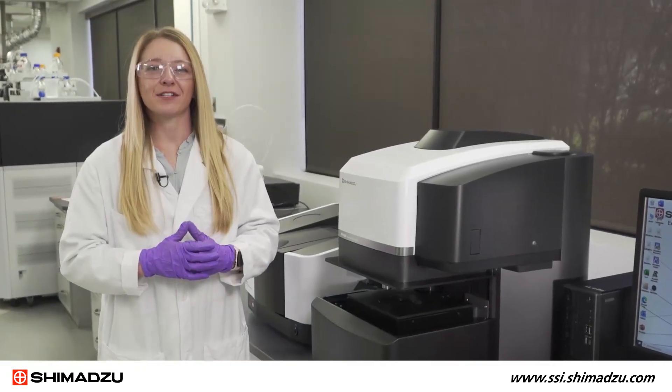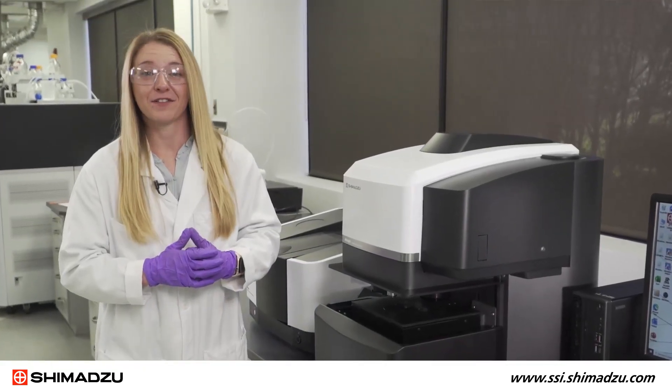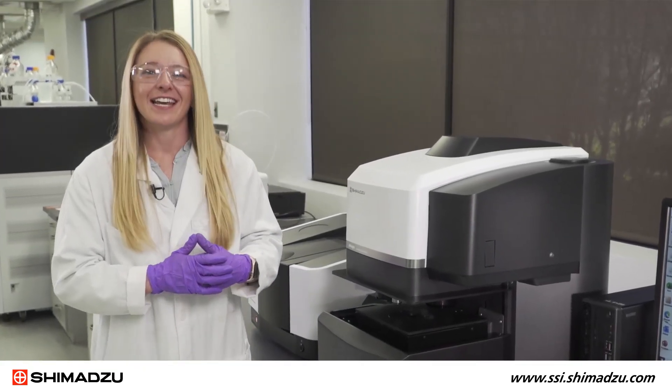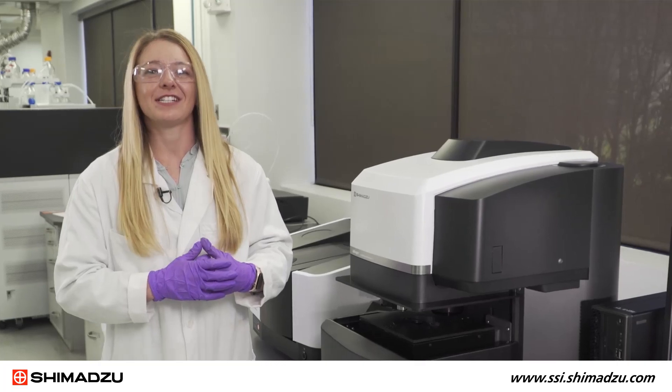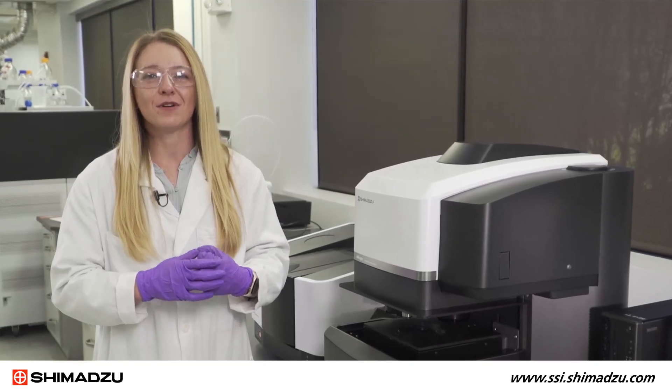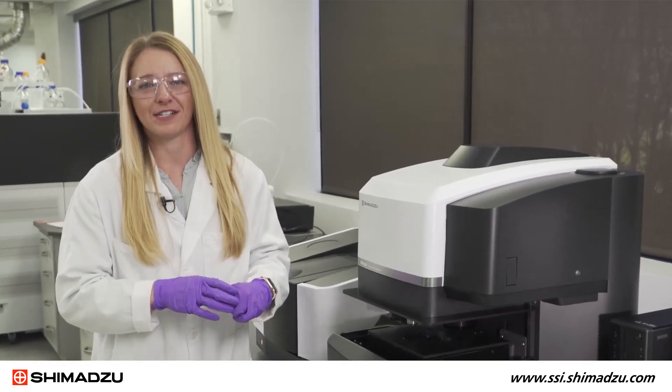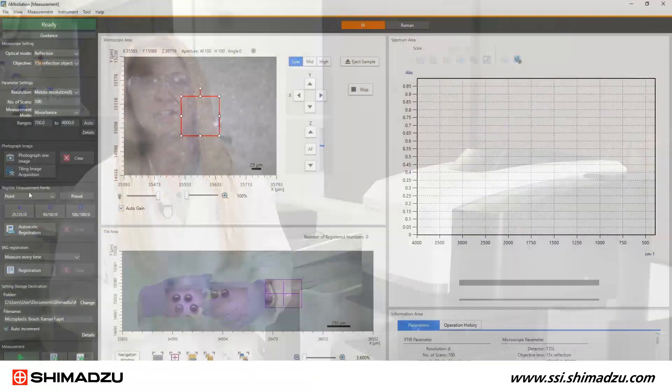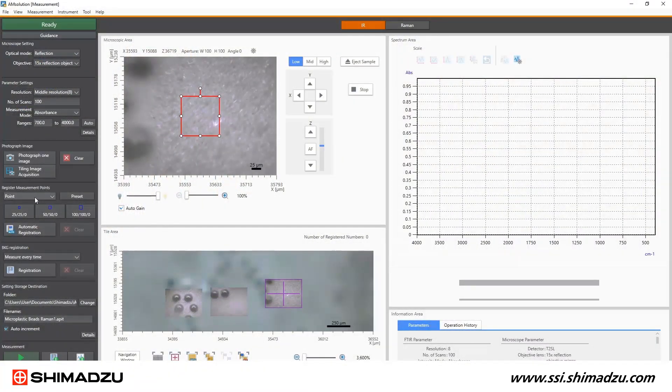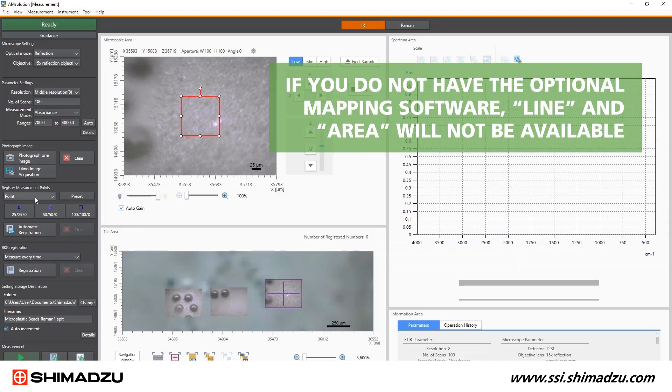Now that we have nice microscope images of microplastics, it is time to start to set a few more IR parameters. Select measurement type from the register measurement points menu. I'm going to select point for this example to look at each microplastic independently. If you do not have the optional mapping software, line and area will not be available.